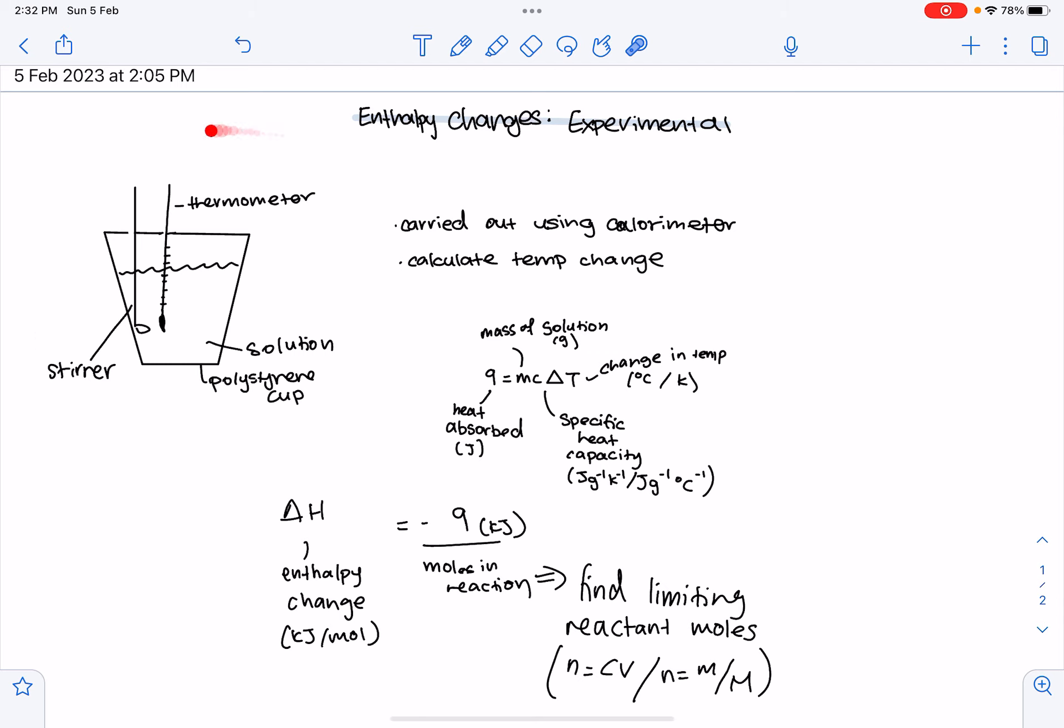So, this is the apparatus. As you can see, there's a polystyrene cup, which is a good heat insulator and reduces heat loss to surroundings. And then the expanded polystyrene cup also absorbs very little heat itself, so there's no need to calculate the heat absorbed by the calorimeter. The other apparatus would be a stirrer to mix the two reactants, and then a thermometer to calculate temperature.